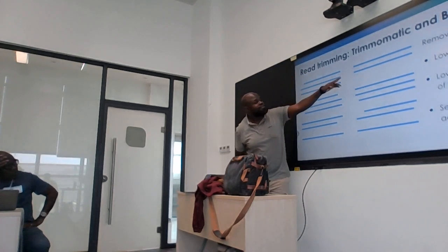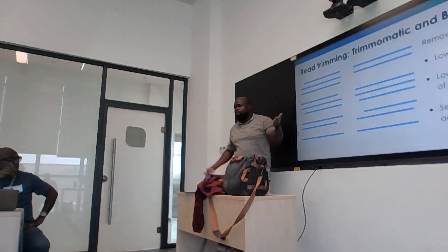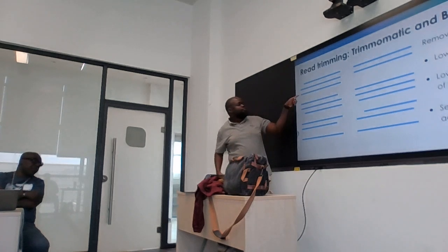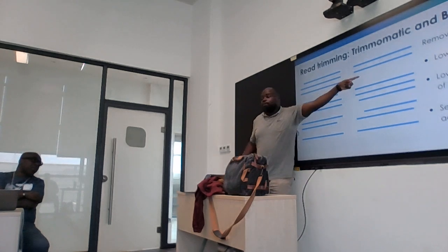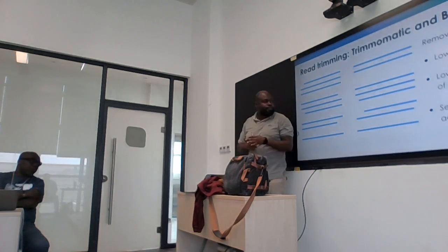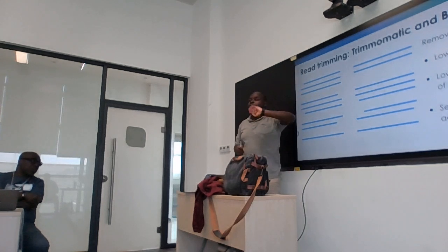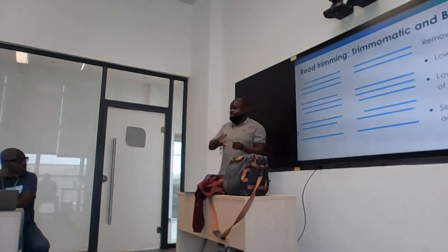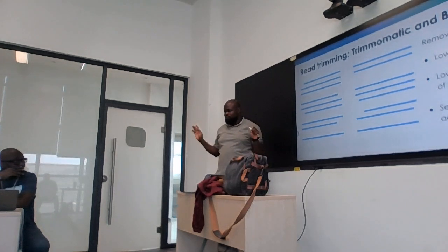You can see these ones have not even been trimmed. Maybe there were no low quality sequences, there were no adapters in those reads. So they are good, right? For this one, the reverse was bad quality and it was thrown out. For this pair, both of them were bad, went out. Okay? So this is what you expect after the read cleaning steps.